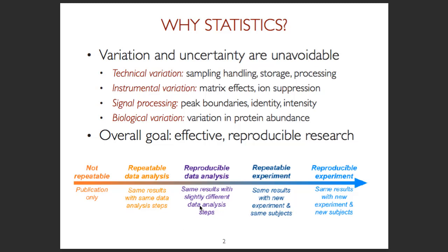Reproducible data analysis means that we know which are the methods which are designed for roughly the same purpose and which methods are not designed for the same purpose. We understand the advantages and disadvantages, and many times there is more than one method which can do a good job with this type of data. So we want to make sure that we know what these methods are, we use them appropriately, and in this case, we will have results which are mutually consistent.